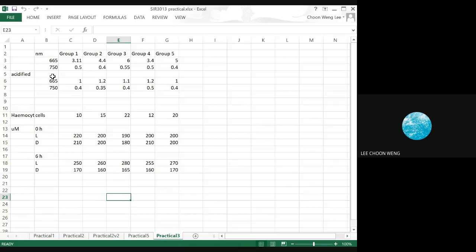But you need to have a spectrofluorometer. Not every lab has it, but most labs will have a spectrophotometer. So it is easier to measure chlorophyll A using the spectrophotometric method, but spectrofluorometry is of course more accurate.